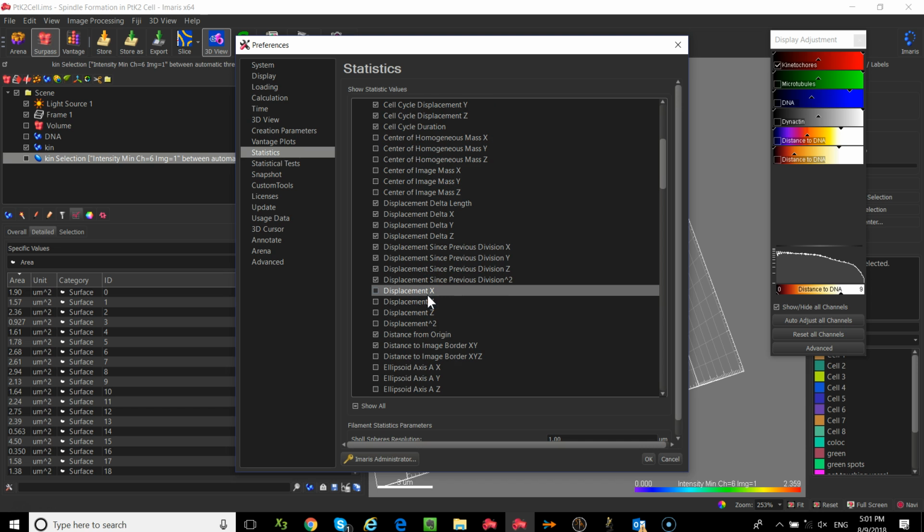I would probably tell you, if you're using the BIDC and it's a shared facility, you probably don't want to turn a bunch of statistics off. You probably want to just add more rather than take them off, because it will potentially confuse some other people who are trying to get some numbers.